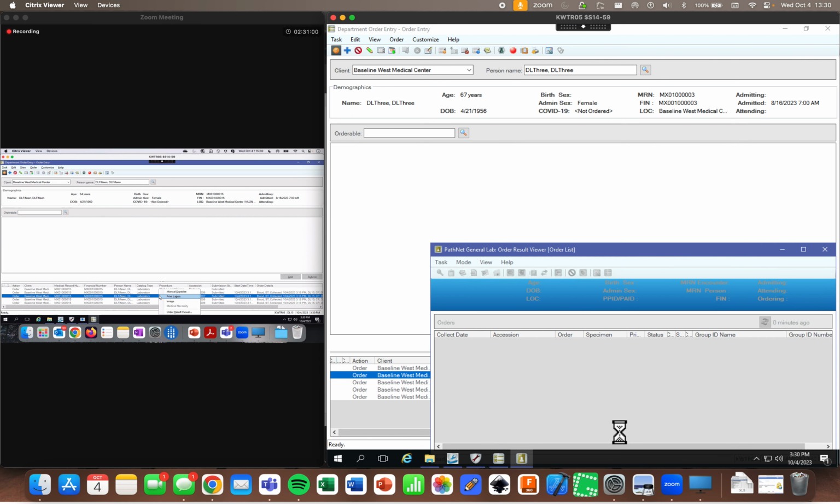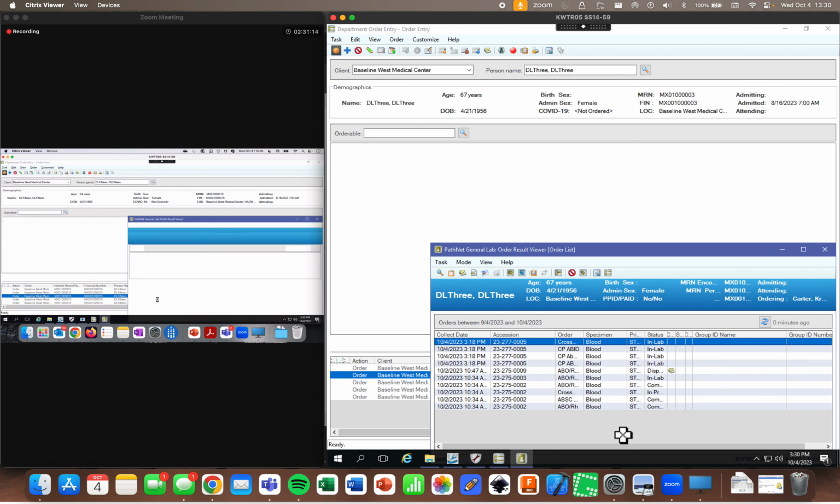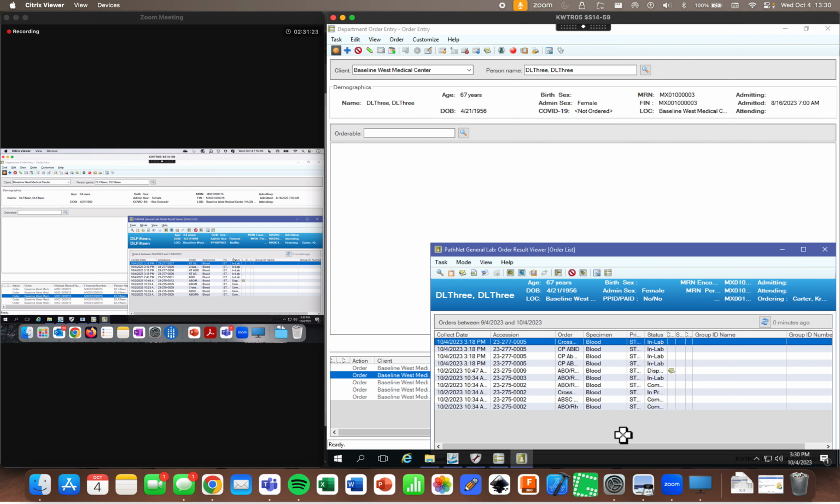So the way I have us place the orders with them already marked as collected, already in a receive location, they hypothetically should be ready for testing right away. But I do like to double check. Sometimes there'll be folks that miss the step about marking it as collected, and then we have to go through and do the collection step.